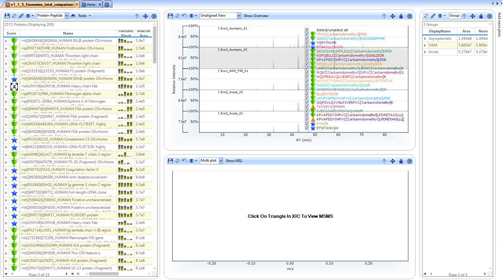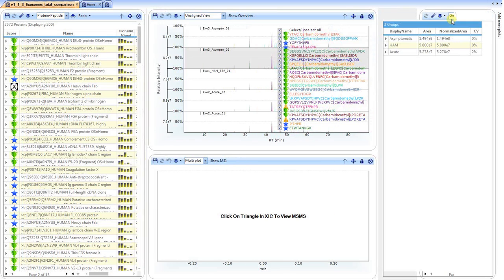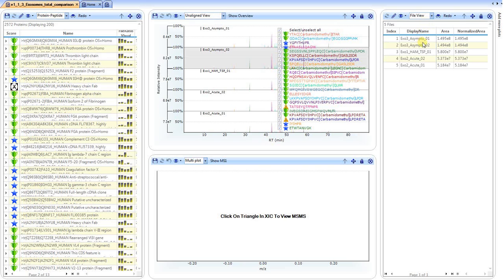And the data that we're going to process, there are 3 different groups. And within the groups, and we can resize this here, within the specific groups we can look at the file areas or the files. We have 2 for one group, 1 raw file for the middle group, and then the last 2 belong to, again, the 3rd different group. And the order that you see here, and of course the grouping has already been covered in a video, but this will then show the arrangement or the order for our gel plots.